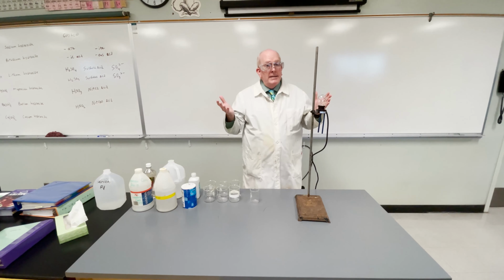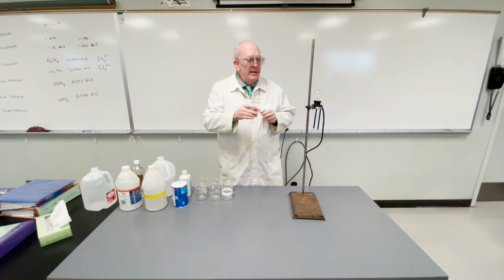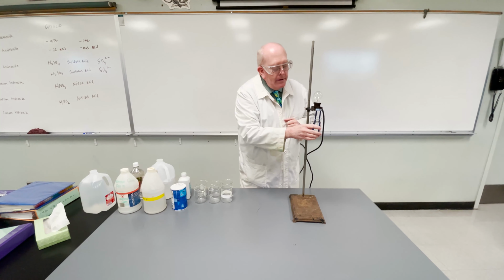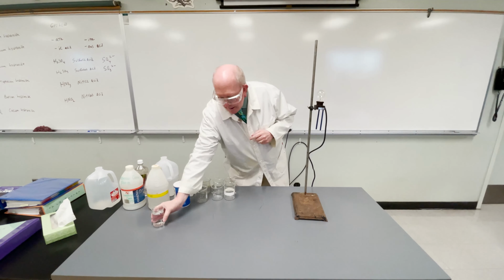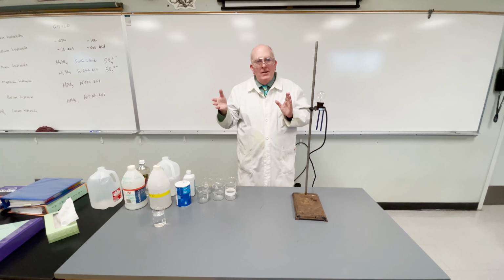So what we're going to do to start off with is take some distilled water, okay? And I'm going to fill up this beaker with it. My whole point of this distilled water is just going to be washing. So take this, I'm going to clean off these posts, and you will notice that no electricity is being conducted because distilled water has no ions floating in it, okay? The water itself doesn't conduct the electricity, it's the ions in the water.